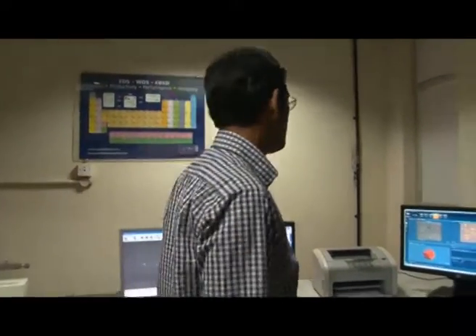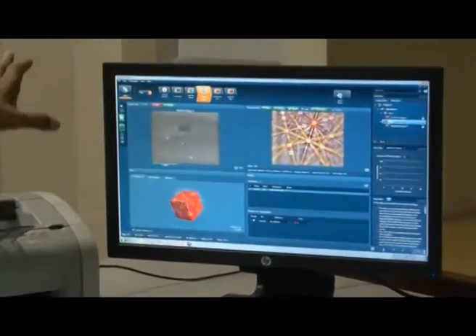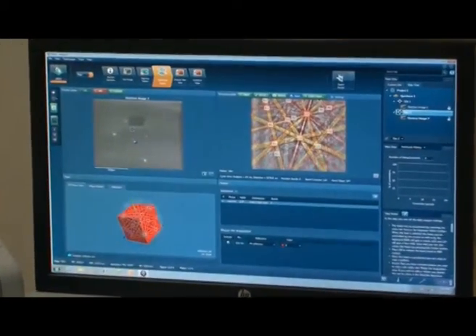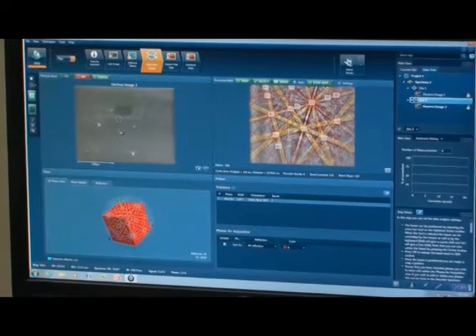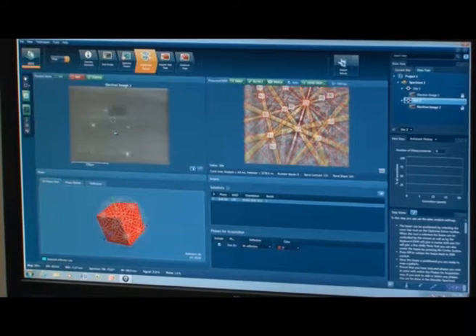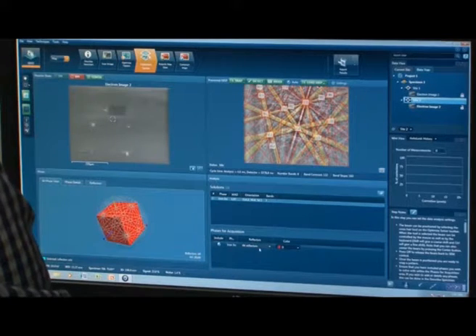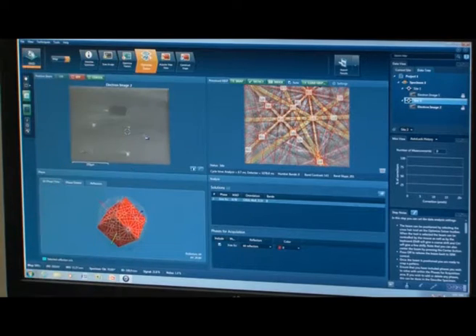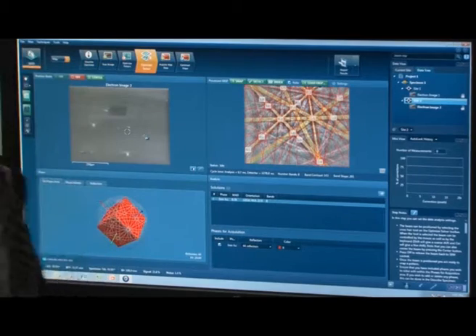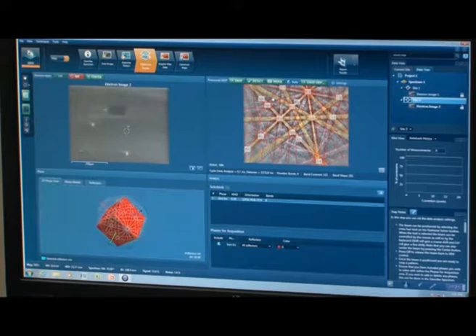We would like to show you how this is done online in a fully automated system. As you see on the left side of this computer screen, there is an electron micrograph, which is a backscatter electron micrograph taken when the sample was tilted to 65 to 75 degrees, and as I click, you will see that a pattern will appear on the right side. So, if I click it here, a pattern appears on the screen and you can see the pattern is even indexed.